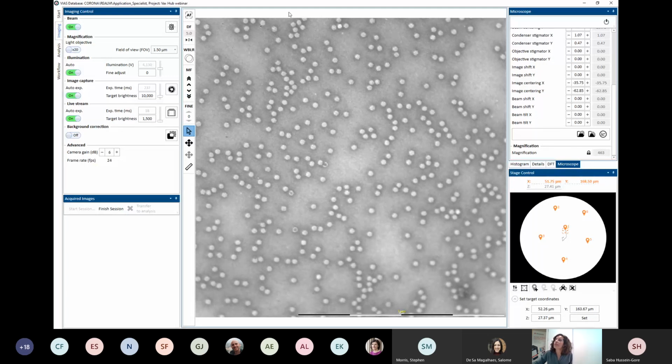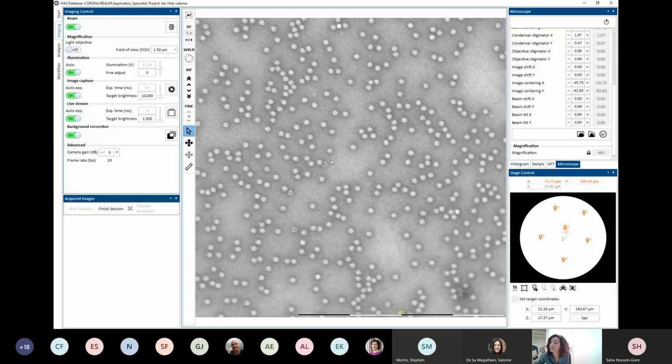Okay, I'll tell you. Most of them look white. Actually, I can turn this on. This one down here looks like it's dark in the middle. So does this one, and this one looks like it's broken.